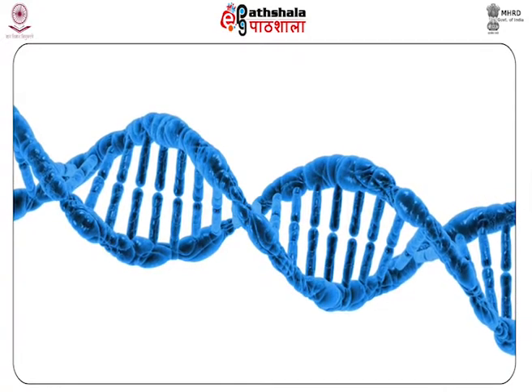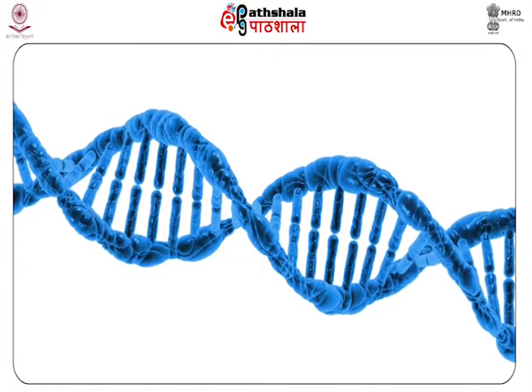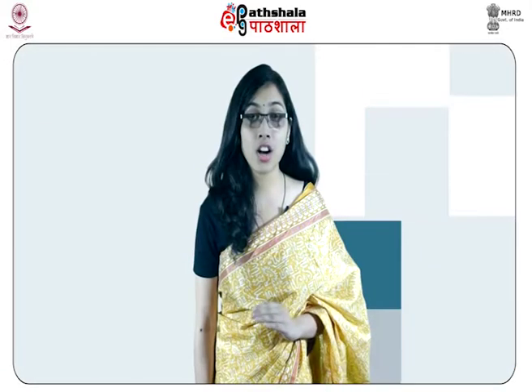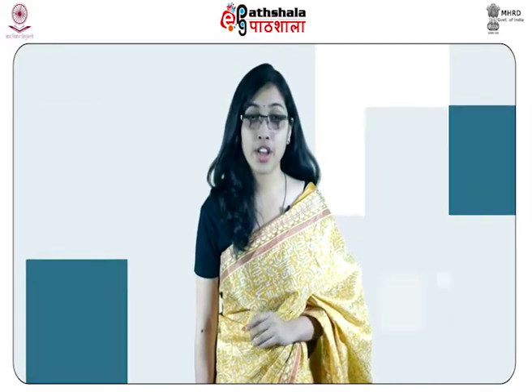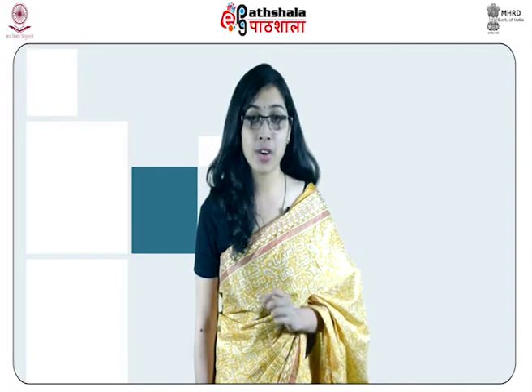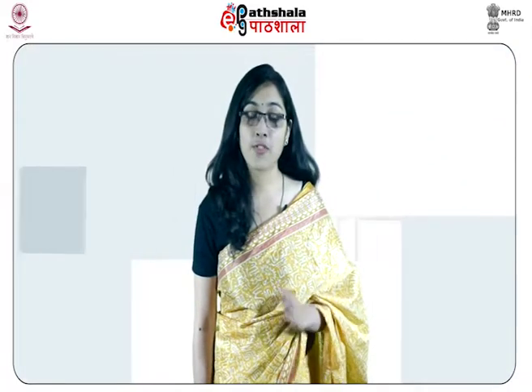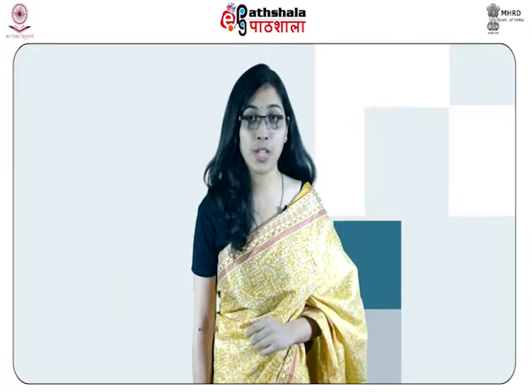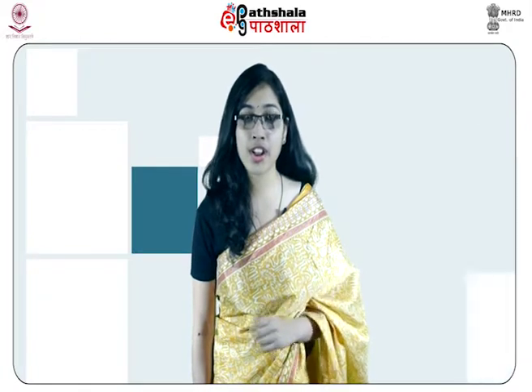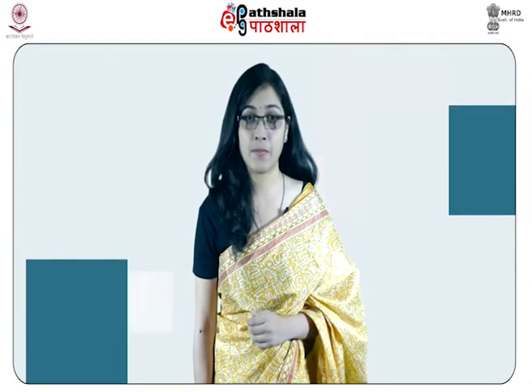For example, alcohol and hydrogen peroxide do not destroy DNA. Cleaning of the collection equipment should be done by wiping it with the fresh 10% bleach solution of 10:1 water to bleach ratio. Since all the evidences are subjected to deterioration, careful collection and storage of the evidences is necessary.